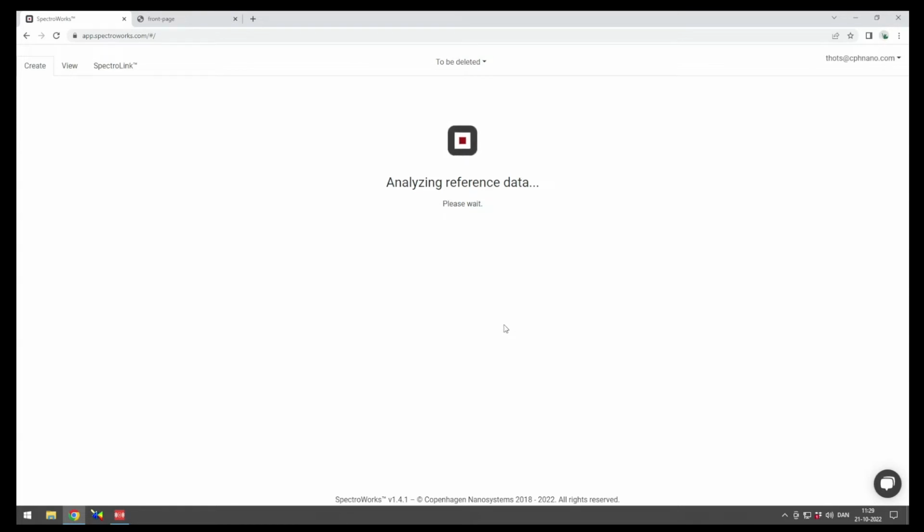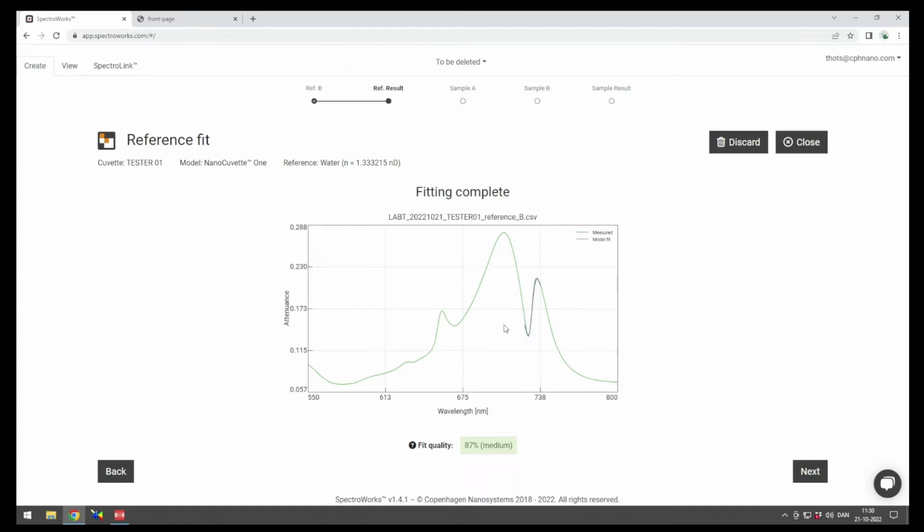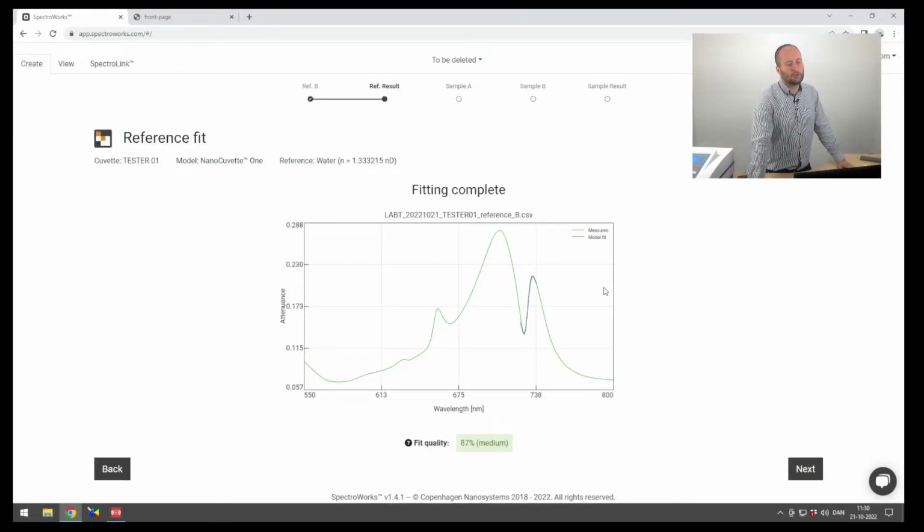So you predominantly work with the Red Tide series, right? No, we have not worked with that before. I know Richard can comment on that as well, but to my knowledge, we have not worked with the Tide in the past, no. I think that's after they changed names and identity, but we predominantly work with the USB model here, which is a little bit of an older model. But what you see now is I actually managed to clean the crystal better than before, so we get a higher value now than we did before.